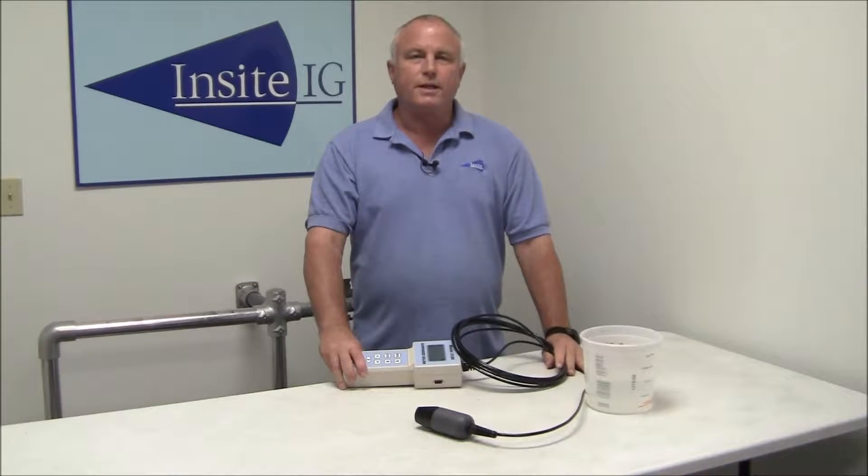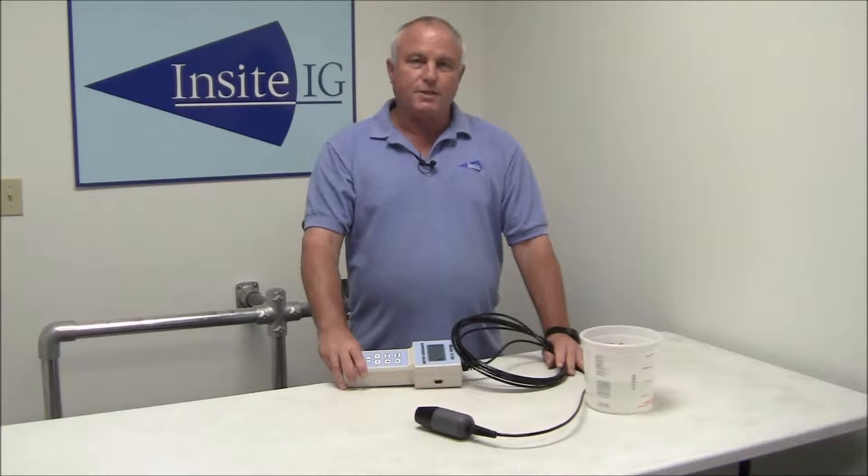Hello, my name is Rick here at Insite IG. Today we're going to do a short video on calibrating the Model 3150 portable suspended solids meter.